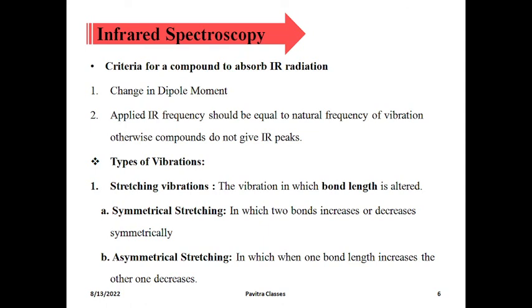In the stretching vibration, the bond length is altered, as the name suggests. Stretch means bond length: it will go far and it will come near. In the bending vibration, the bond angle will be bent, so the bond angle will be altered. In the stretching, again two subclasses are there: symmetrical stretching and asymmetrical stretching.